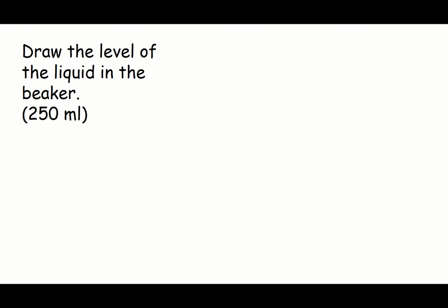Today we will be looking at how to read the scale on a beaker or a measuring cup. They are both similar. This is from page 41 of your workbook, where you are asked to draw the level of the liquid in the beaker.